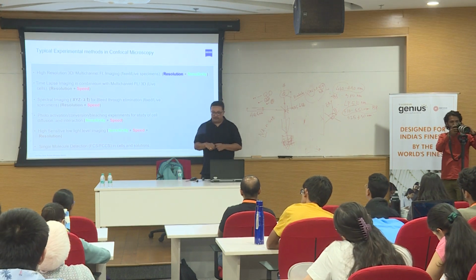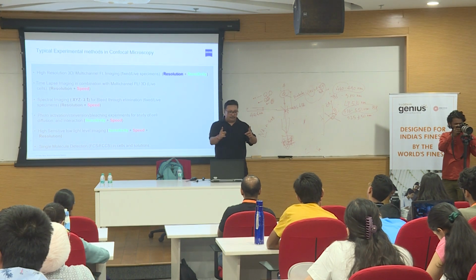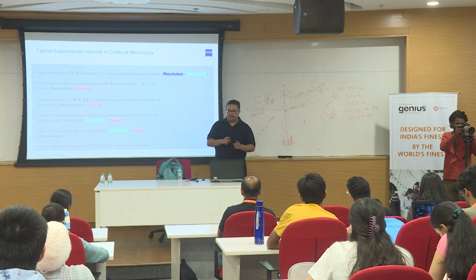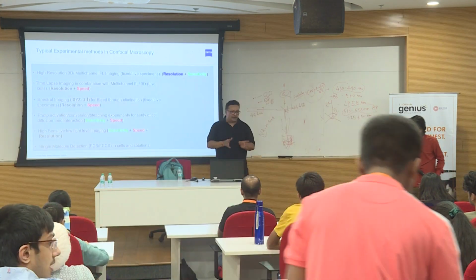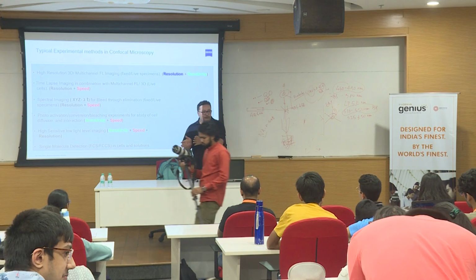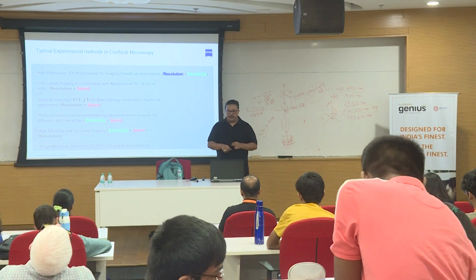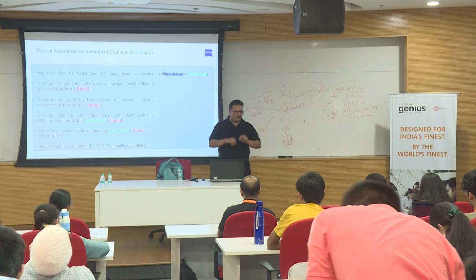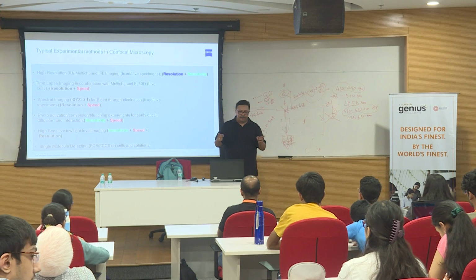If you have a 6 inch scale, and your sir says, show me a measurement of 7.5 inches, can you do that? No, because your scale is not compatible to measure 7.5 inches. But if somebody says, with a 6 inch scale, show me a measurement of 4.5 inches, you can easily do that because it is within the dynamic range of your scale.